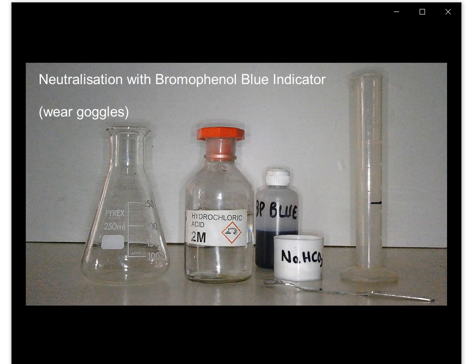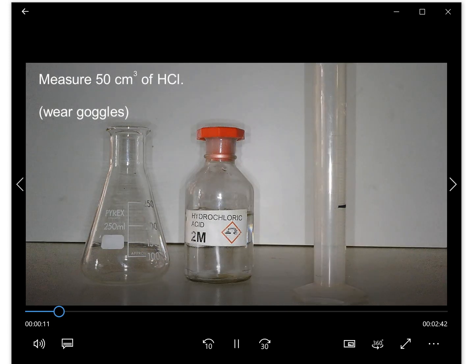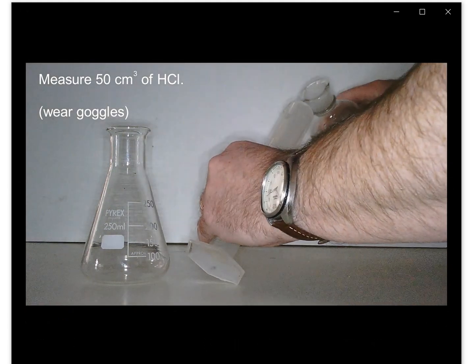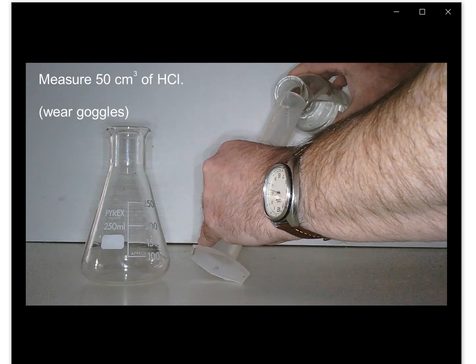So we've got our hydrochloric acid. This is our sodium bicarbonate. That's the chemical symbol for it. Going to accurately measure out 50 centimetre cubed of hydrochloric acid. Very important to wear goggles because it is corrosive.